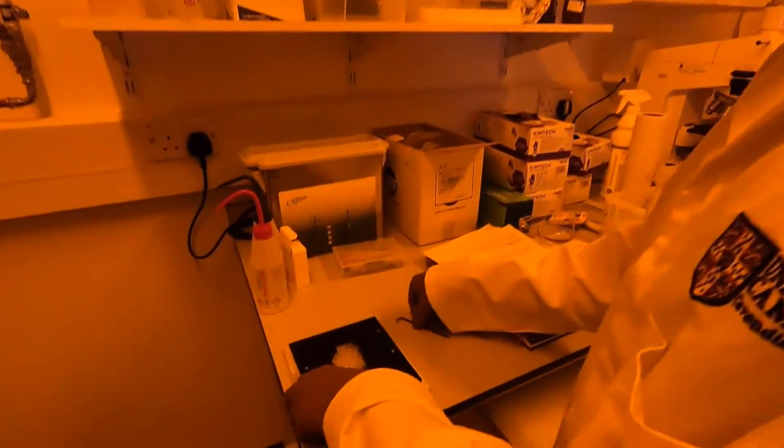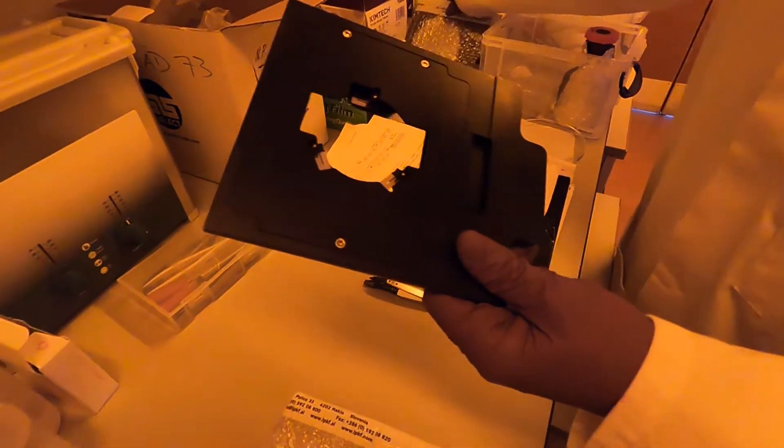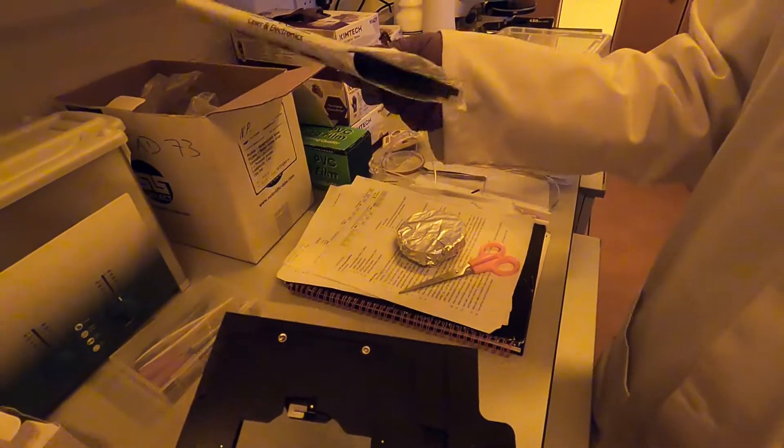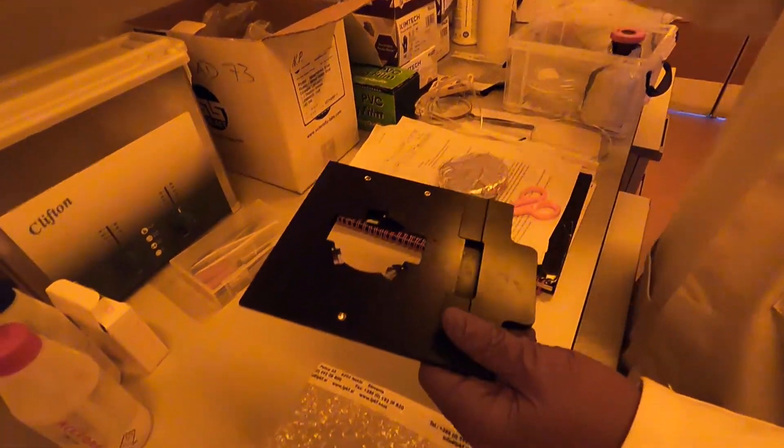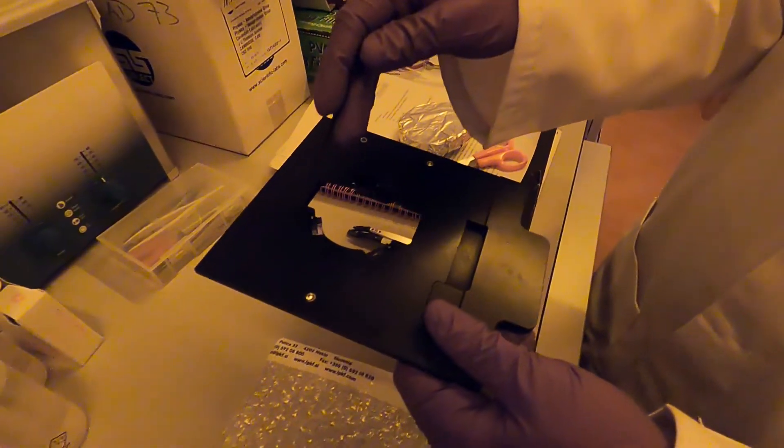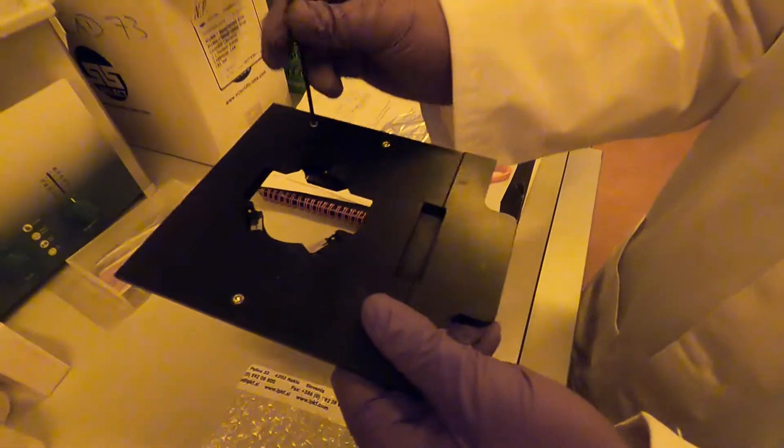While the sample is cooling down I can prepare the sample holder for the laser writer. This is one of the two sample holders that we've got. The 4-inch wafer would go in this one, and in this other one you can put the standard microscope glass slide in this rectangular aperture and in the circular one we can put the 2-inch wafer.